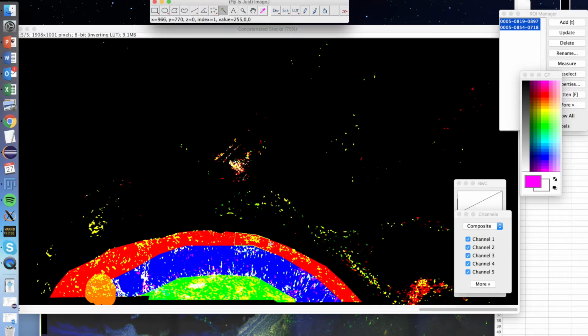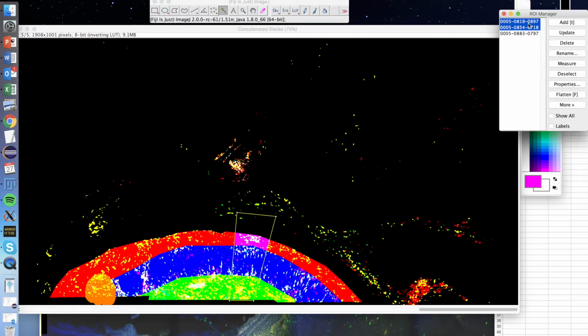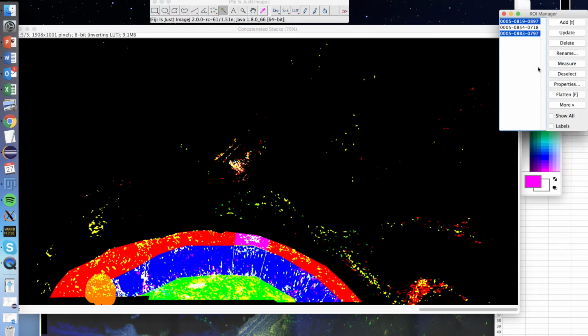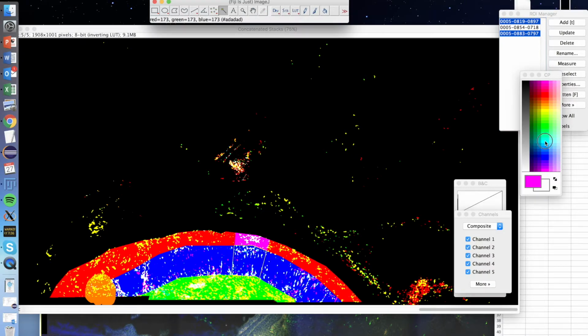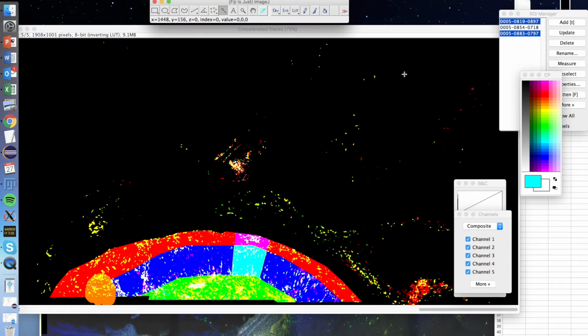I'm just going to get magenta, I'm going to click fill, and we turn it magenta. We'll do the next one, one tool, click T, select our wedge shape, and our blue shape, get the intersection, we're going to do it in cyan, and we're going to fill.